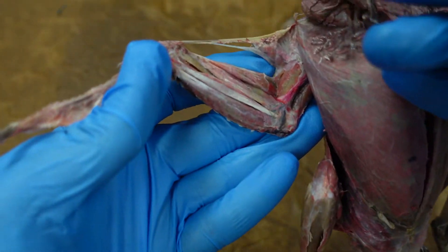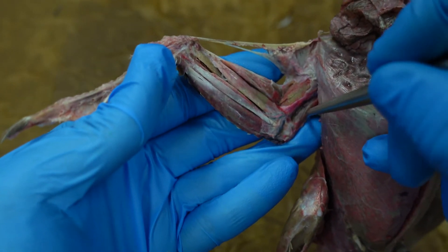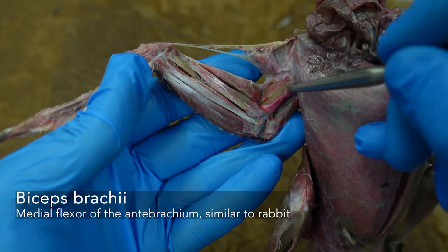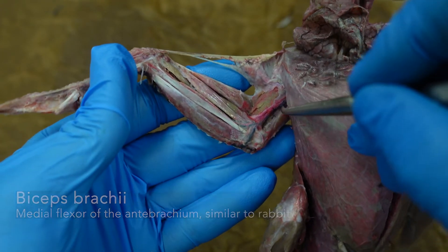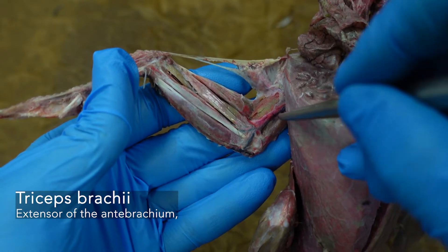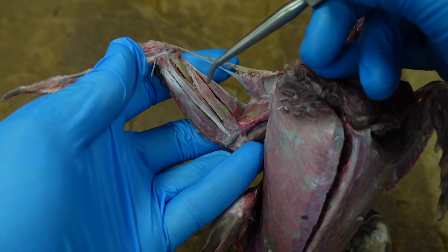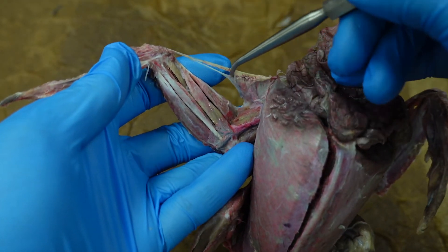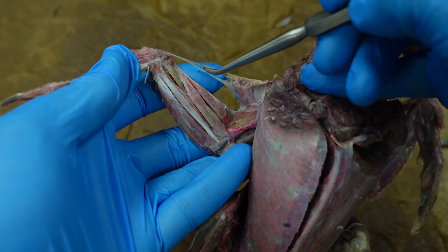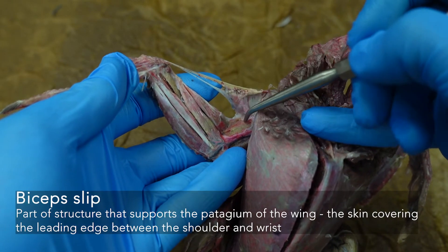The muscles of the arm — you can see some similarities between the rabbits that you have already dissected. We have our biceps brachii and our triceps brachii. One head you can see from the medial side. This triangle of tissue is the patagium, that front edge of the wing, and there's a patagial tendon and a biceps slip here.